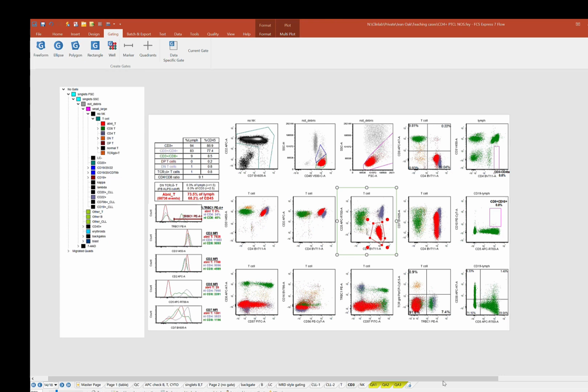So one thing that I'm taking away from this is that you're using the difference from normal approach from the immunophenotype in combination with TRBC1, and you shouldn't really use TRBC1 without knowledge of the immunophenotype. Do I have that right?